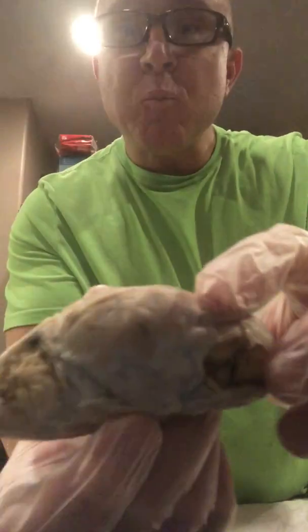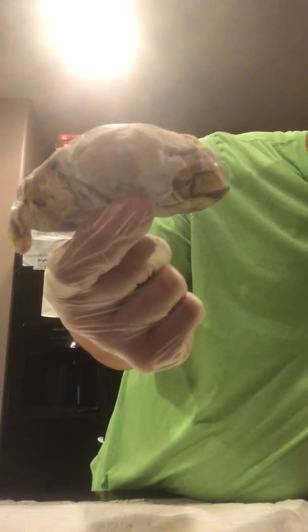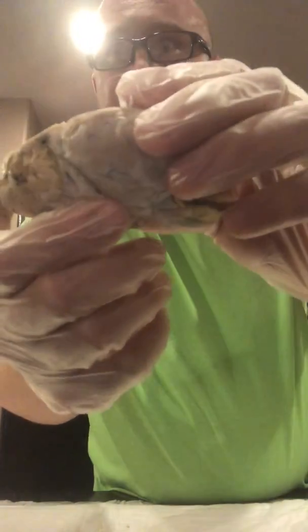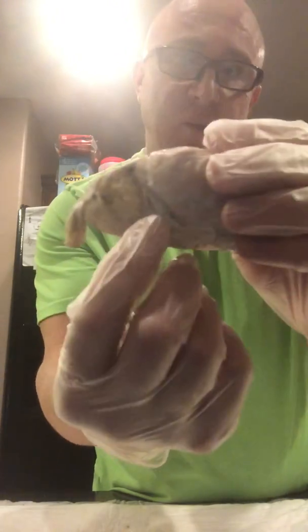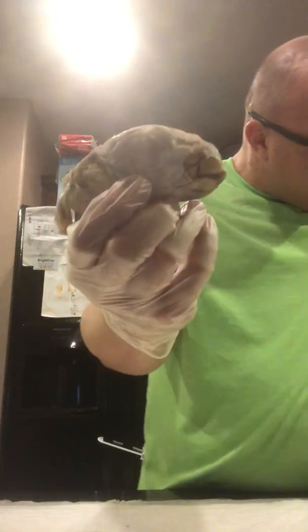And then from the cerebral aqueduct, just below it, we will have the fourth ventricle. The arbor vitae, that's going to be just behind the fourth ventricle, in between the cerebellum and the fourth ventricle.